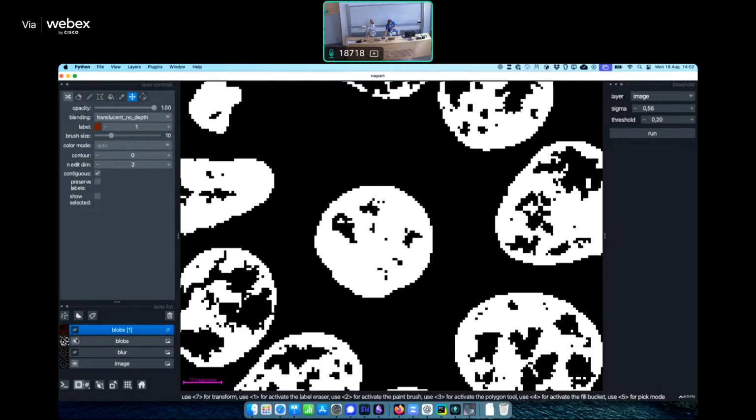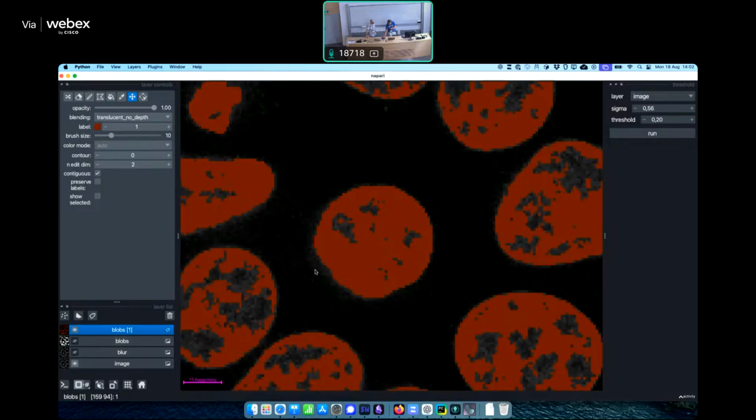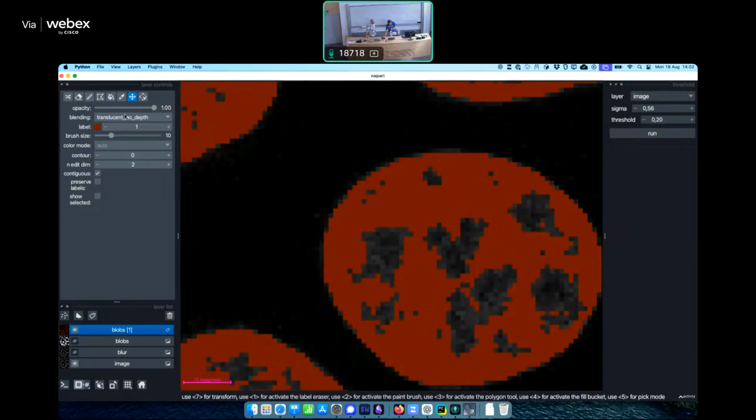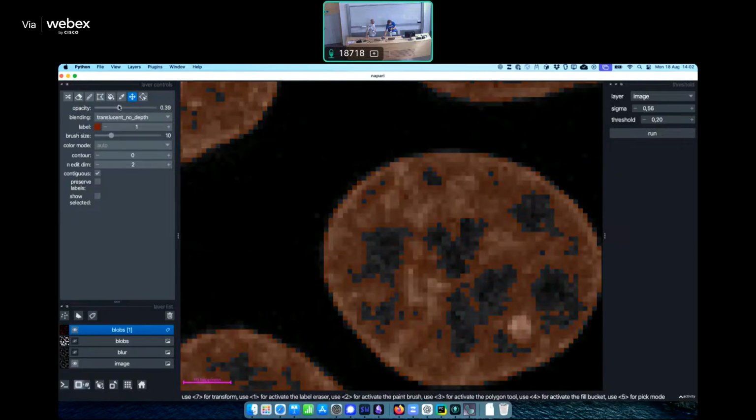If we switch to the labels, by default it only hovers over the data. You might see the original data is still visible through the holes, and if we have smaller opacity, it's even better visible. So the task for now is to see the code, find how to change it to the labels, and maybe even set a different opacity.